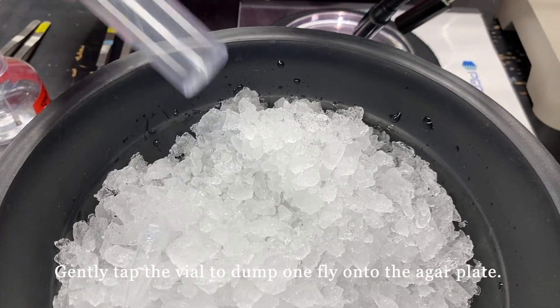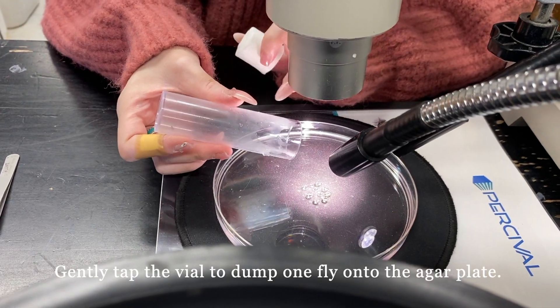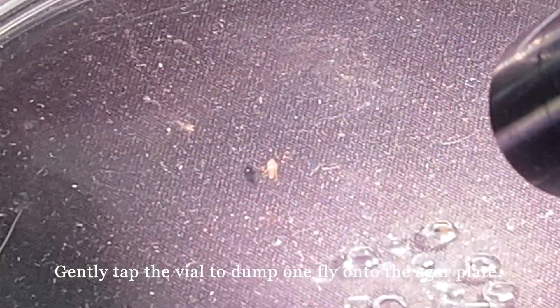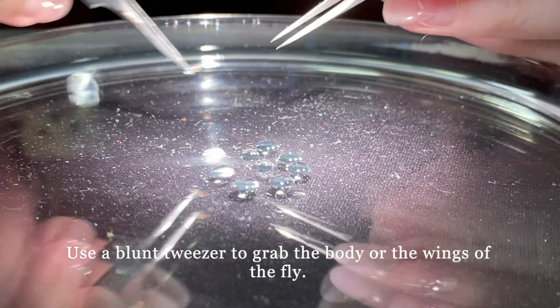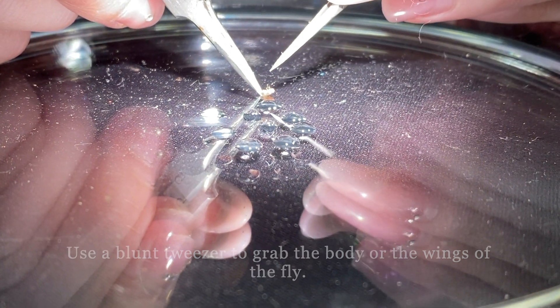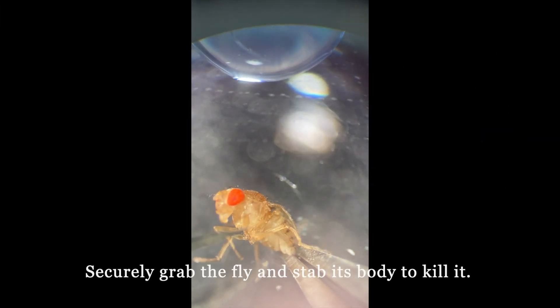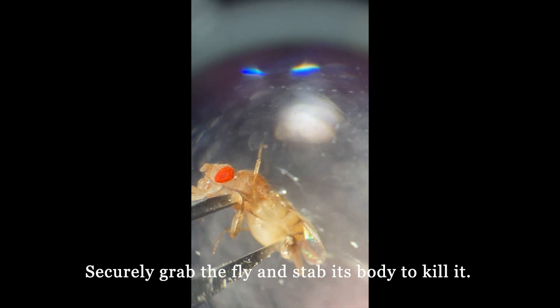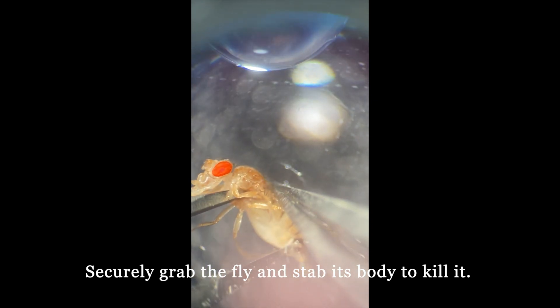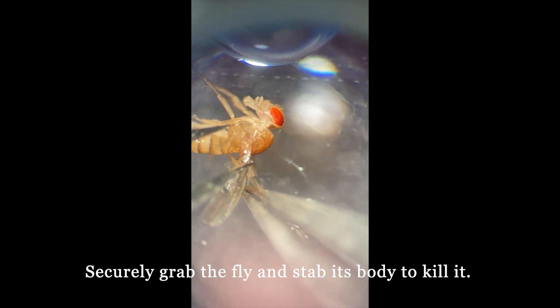Take out the vial and gently tap it to dump one fly onto the agar plate. Using a pair of blunt tweezers, grab the body or the wings of the fly. Securely grab the fly and stab into its body to kill it. This prevents the fly from waking up and moving around, and makes it easier to take off the head.